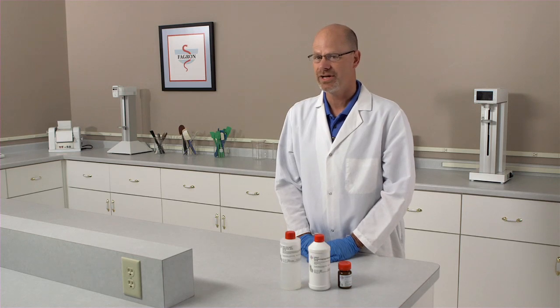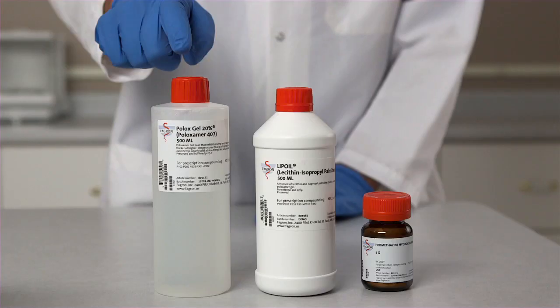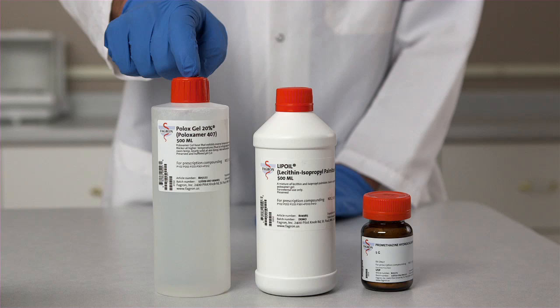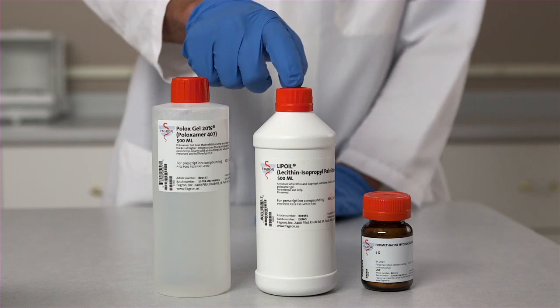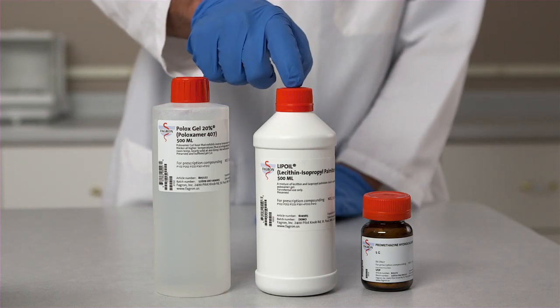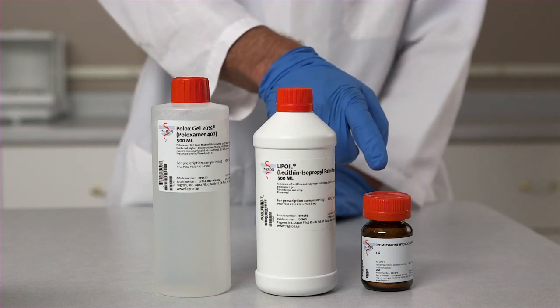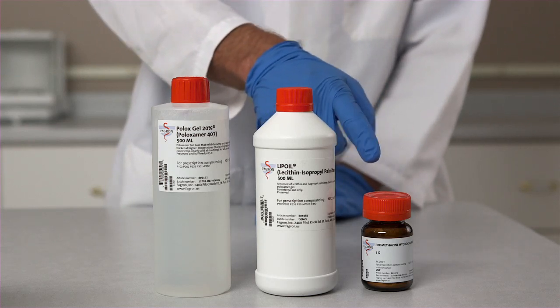The ingredients needed for this preparation are Fagron's Paloxamer 20% gel, lecithin isopropyl palmitate or lip oil as it's commonly known, and an active ingredient. In this case, we're going to be using promethazine.